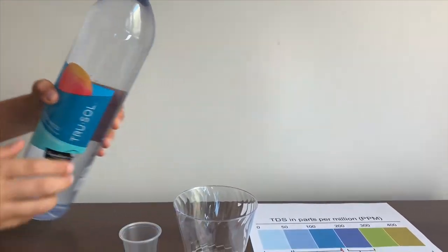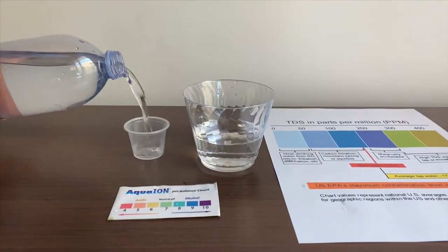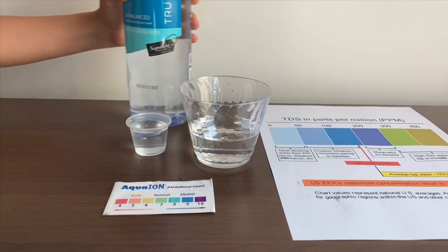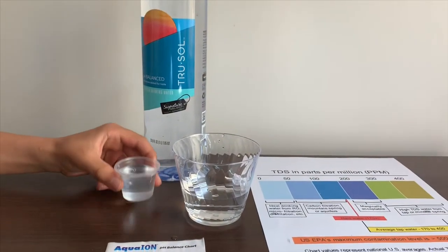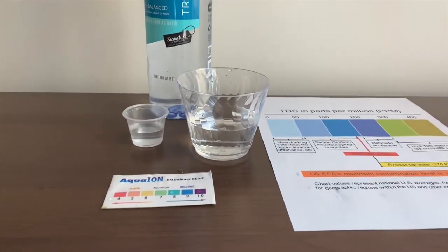Let's pour some water in. This is a little too much for the pH cup, so let's pour some back. First, let's test the TDS level.